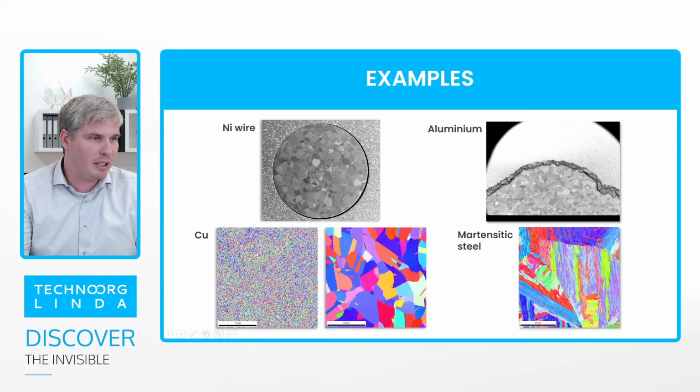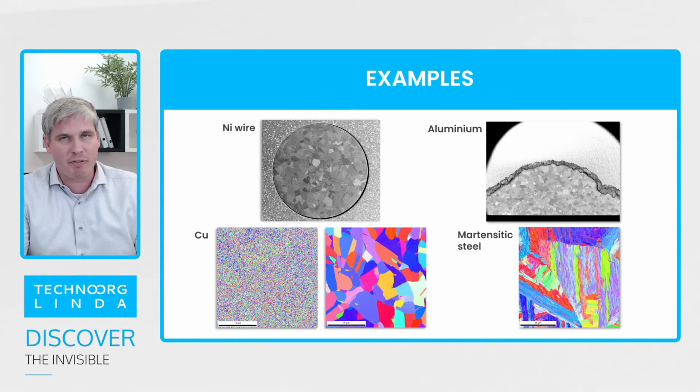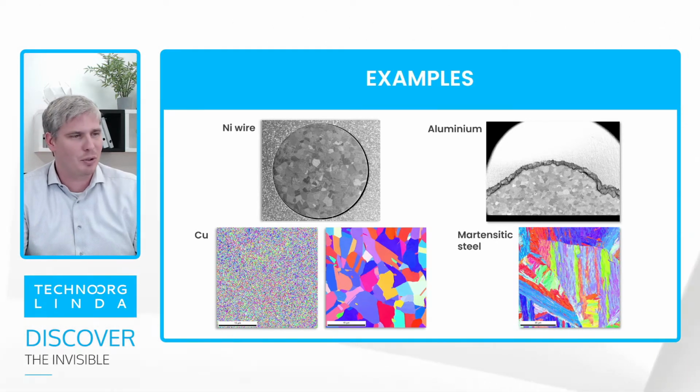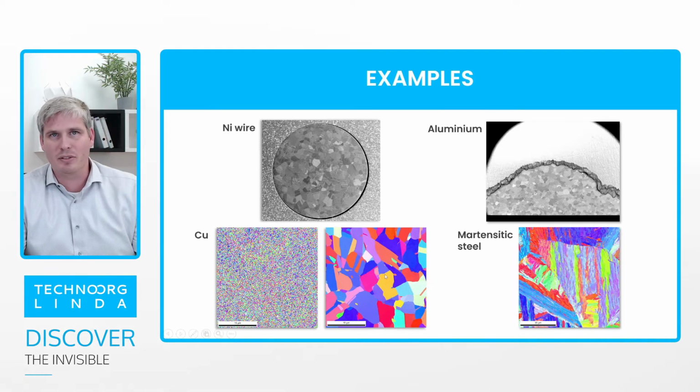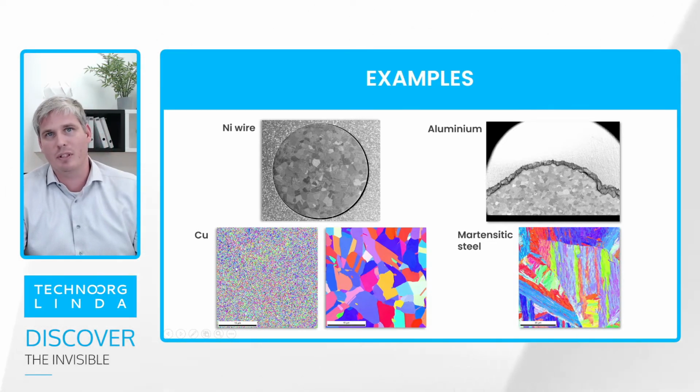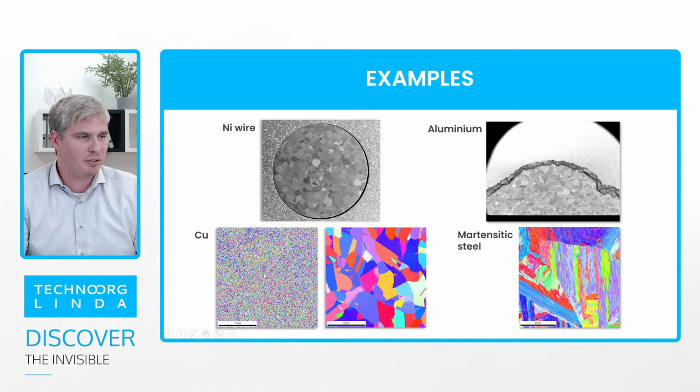So what you can see here is a sample after a very fine mechanical preparation. In some materials, you may have good results after a good mechanical preparation, but it's a material dependent method and very time consuming. So even if it's possible in some cases, it's better to avoid the ultimate mechanical preparation. But after a good quality preparation, usually you have basically nothing, no orientation map.